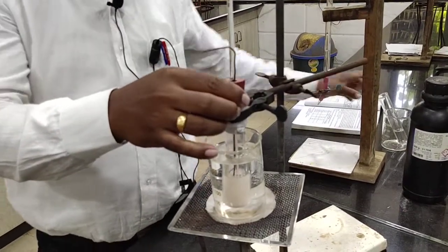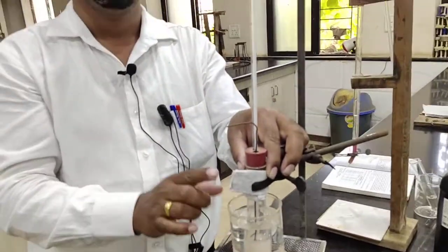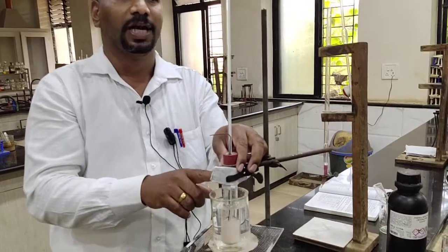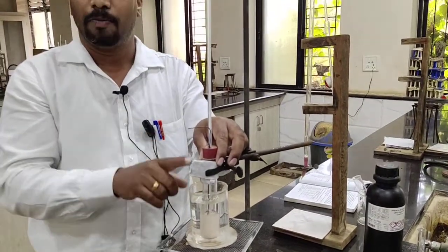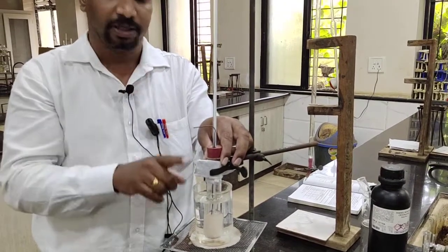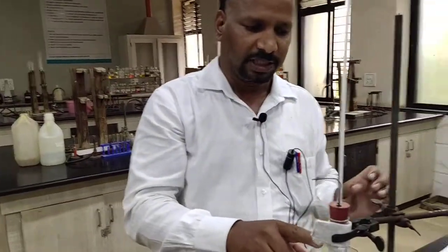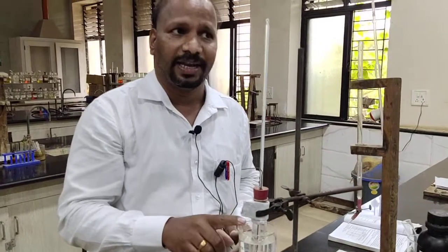Now after this reading is completed, we have to add again 2 ml of water, so that it contains 10 gram of phenol and 8 ml of water. Because already 6 ml of water is there, we take 2 ml of water with the help of a burette and add it. Now the system becomes 10 gram phenol, 8 ml water.